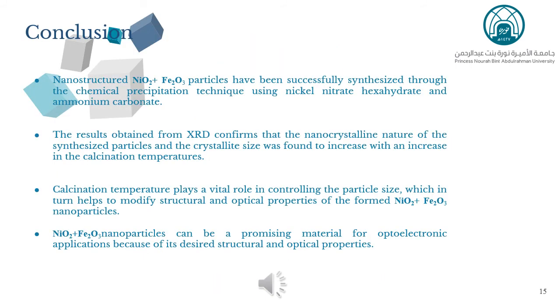Nanostructured nickel oxide and iron oxide particles have been successfully synthesized using the chemical precipitation method. The result obtained from XRD confirms that the crystallite size increases with an increase in calcination temperature. Calcination temperature plays a vital role in controlling the particle size, which in turn is helpful in modifying the structural and optical properties of the formed nickel oxide and iron oxide nanoparticles, making them a promising material for optoelectronic applications.